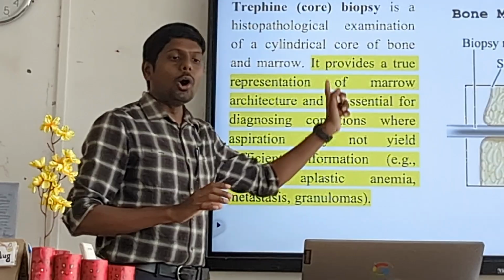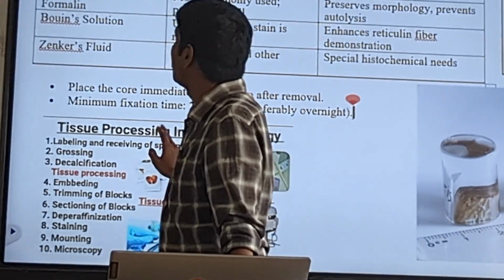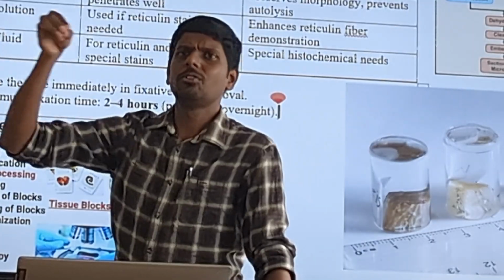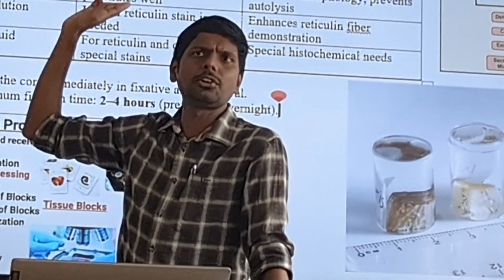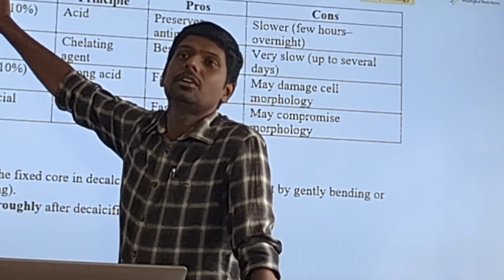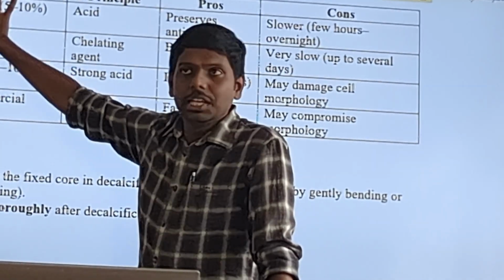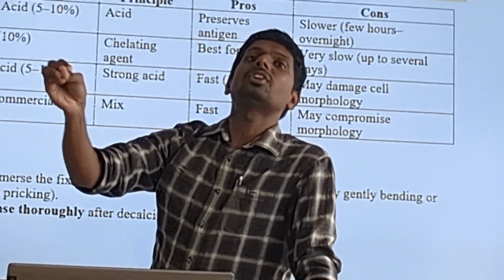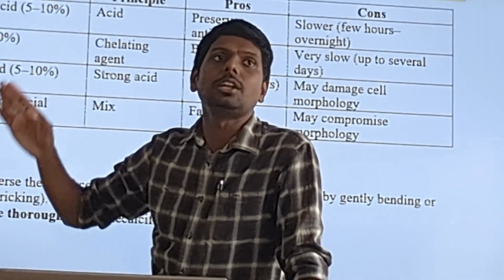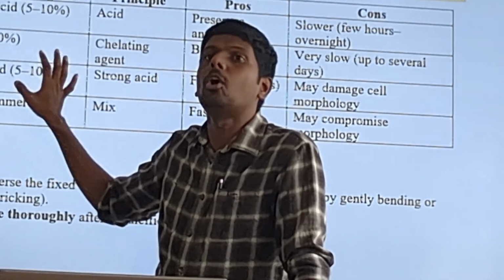That is why for bone marrow sample, okay, first we fix the sample. Immediately after obtaining bone marrow, we suspend it in a fixative. It can be any fixative. Okay. After fixation, this is the important step. Write down. Decalcification. I hope you know what is decalcification, right? Yes, sir. Here, the calcium will be removed from the tissue. Without decalcification step, we should not subject it to the tissue processing. Decalcification is one of the important steps in bone marrow biopsy.